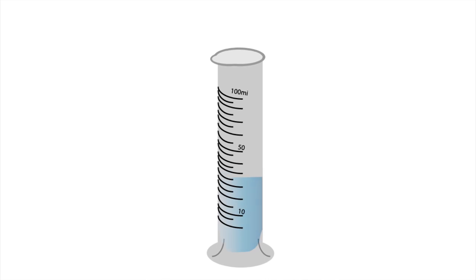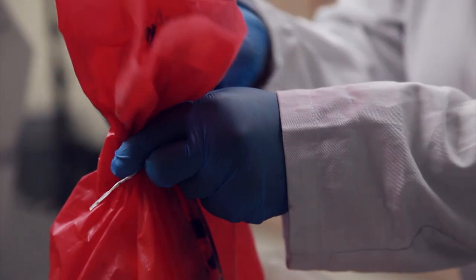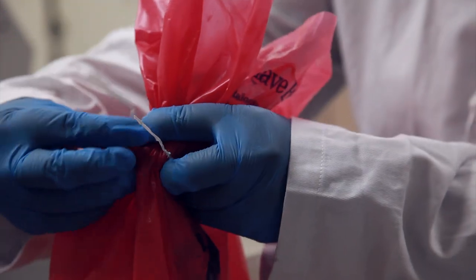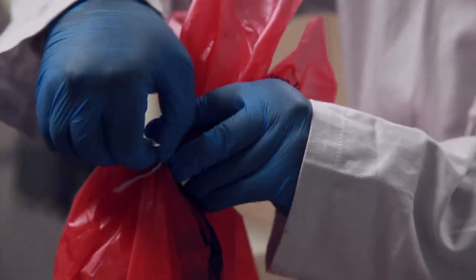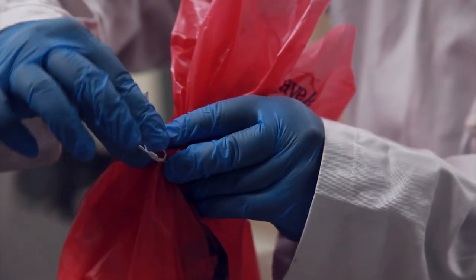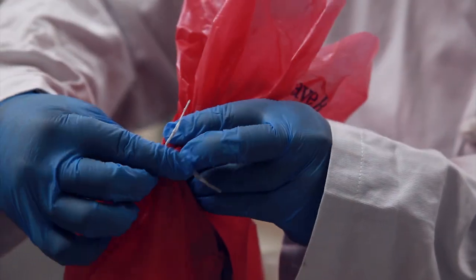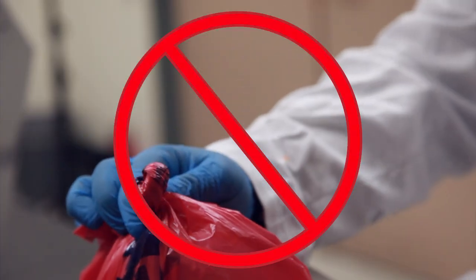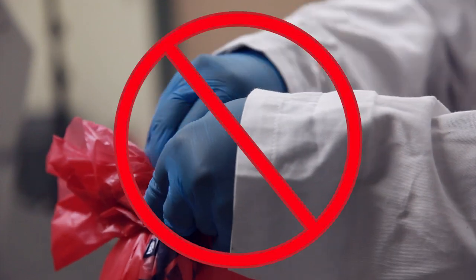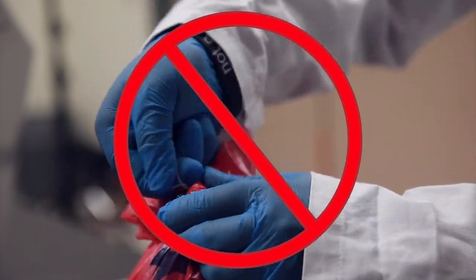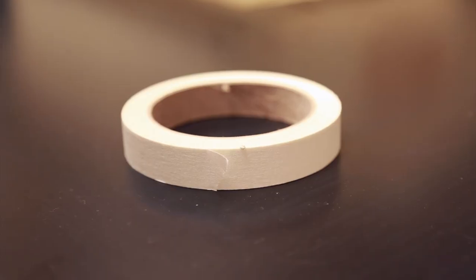Place about 100 milliliters of water into the bag to help with steam decontamination. Gently twist the material above the waste so there is a little opening at the top so the steam can get into the bag. Secure it with a piece of autoclave tape or twist tie. If the autoclave bag is completely sealed during sterilization, the inner temperature of the bag will not be sufficient for decontamination. Finally, place the bag into an autoclave rated pan with shallow sides and put about one inch of water into the pan.